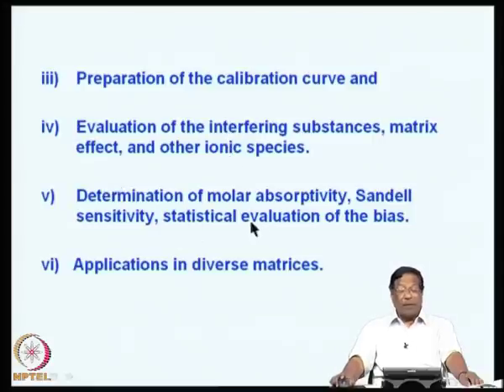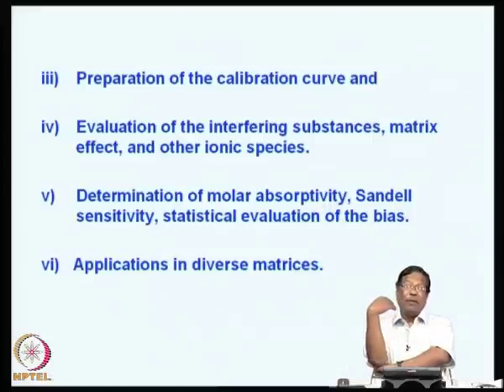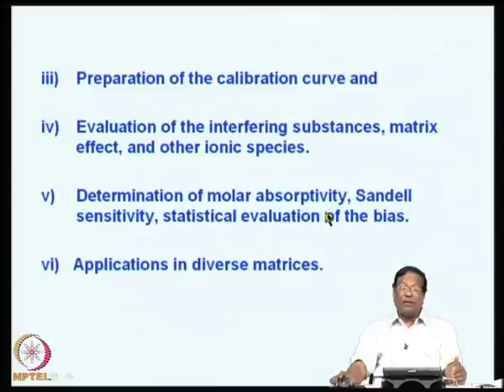Now, you can determine the type of the complex. You have to determine the molar absorptivity. This will tell you how sensitive the material is. So, if the method is very highly sensitive, molar absorptivity would be very high, of the order of between 10 raised to 4 and 10 raised to 5. Suppose the substance is having very low molar absorptivity, the substance would not be colored.